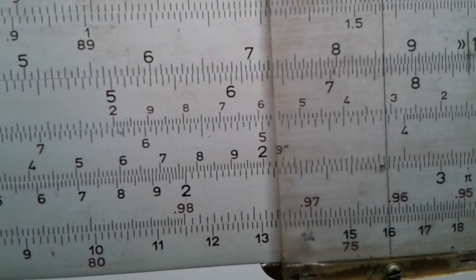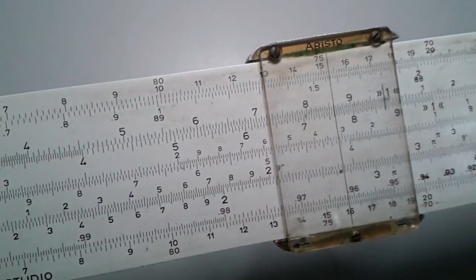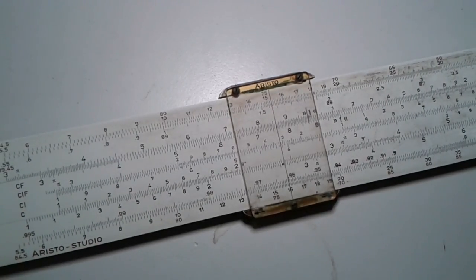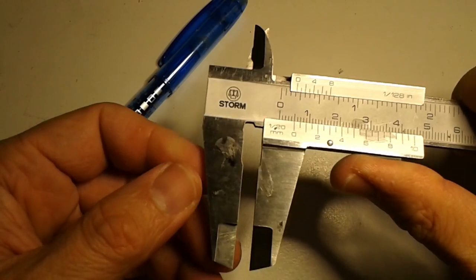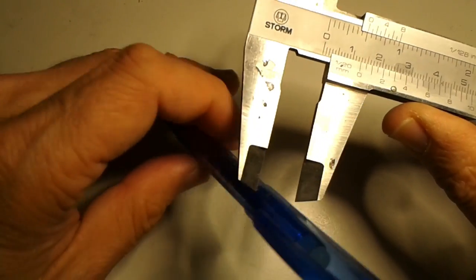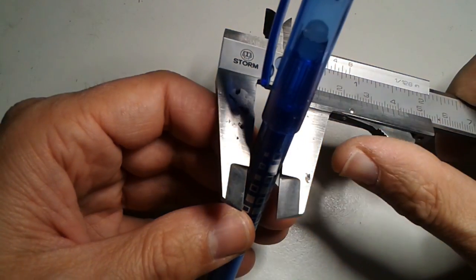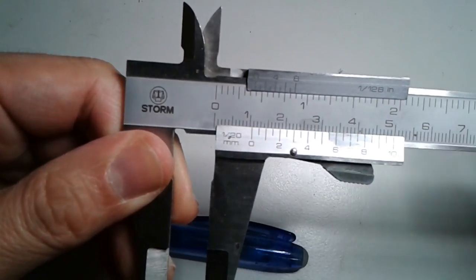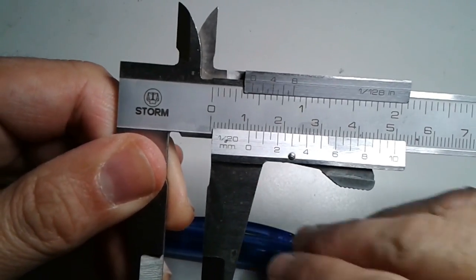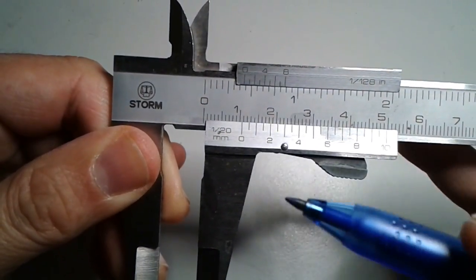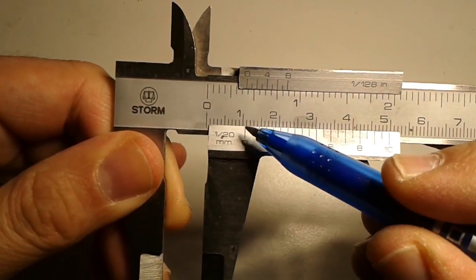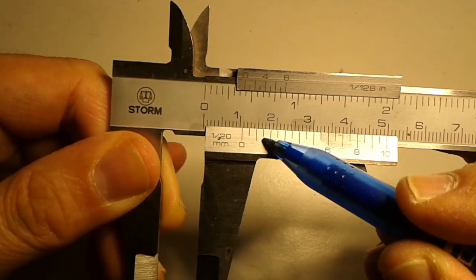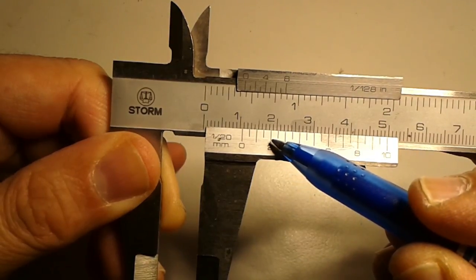And last but not least I also want to show you now a regular caliper for measuring out distances. And this one is actually even more precise. This is an analog caliper. It works in the same way. I can theoretically also measure the diameter of this pen if I want to and then I can read it off in a similar way. So you can actually see that this is now 10 millimeters and a little bit more. So what I have to do now is I have to look on the smaller scale. That's 10 millimeters and now I have to find a pair of lines that is matched up.